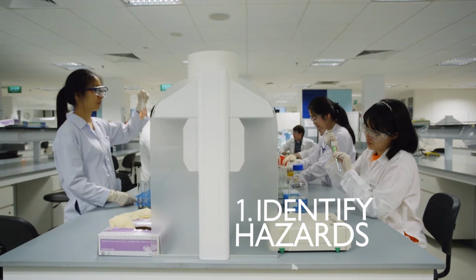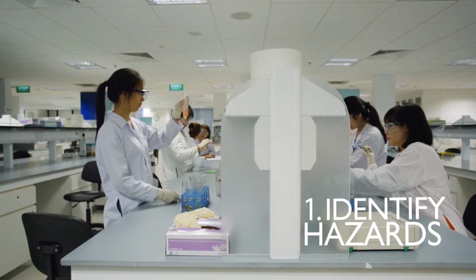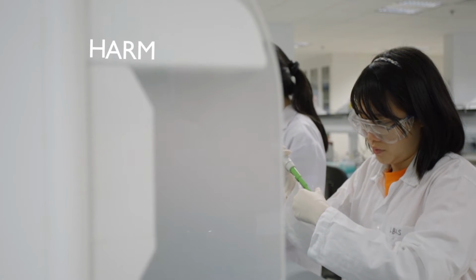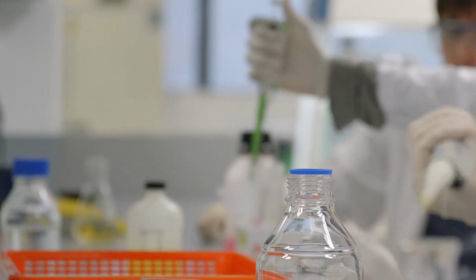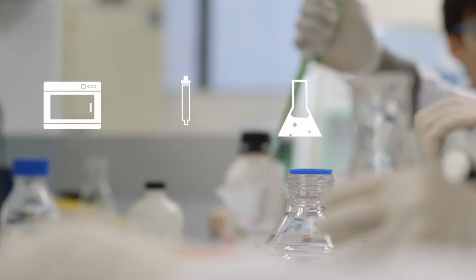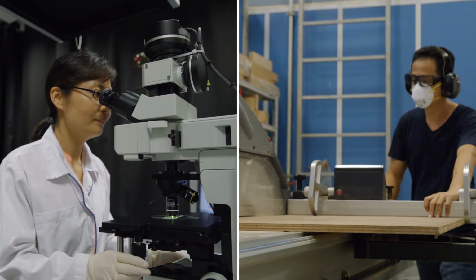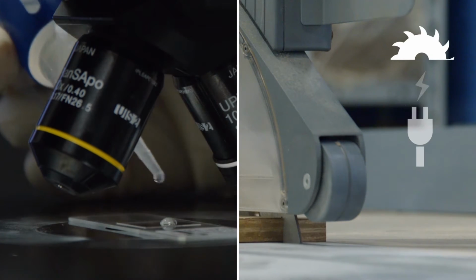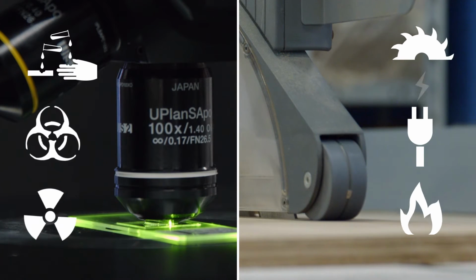The first step in the risk assessment process is identifying the hazards present in an activity. A hazard is anything that can cause potential harm to you or others. Hazards can arise from the equipment that you use, the procedures that you do, or the agents and materials that you use. As you work in the different laboratories throughout the campus, you will encounter various types of hazards, such as physical, electrical, fire, chemical, biological, and radiation hazards.